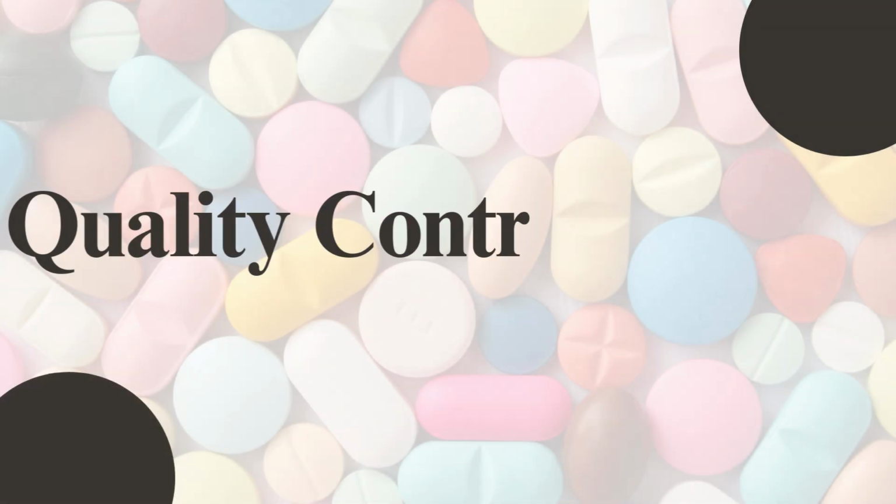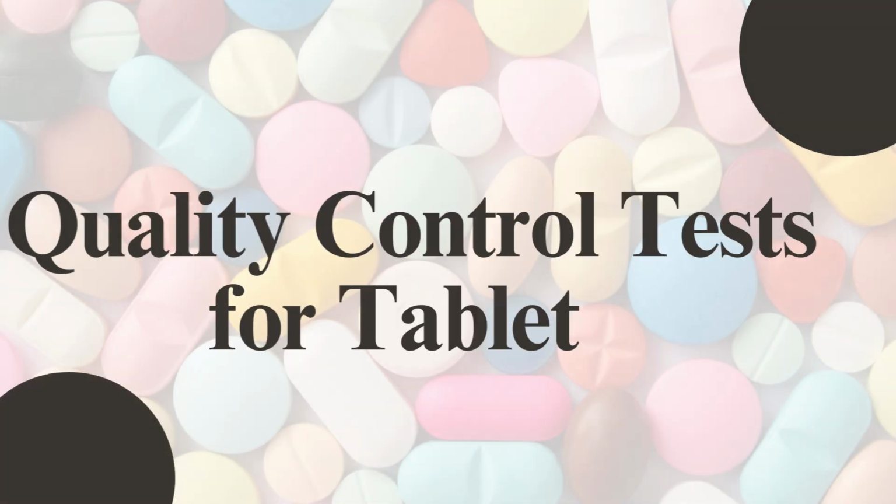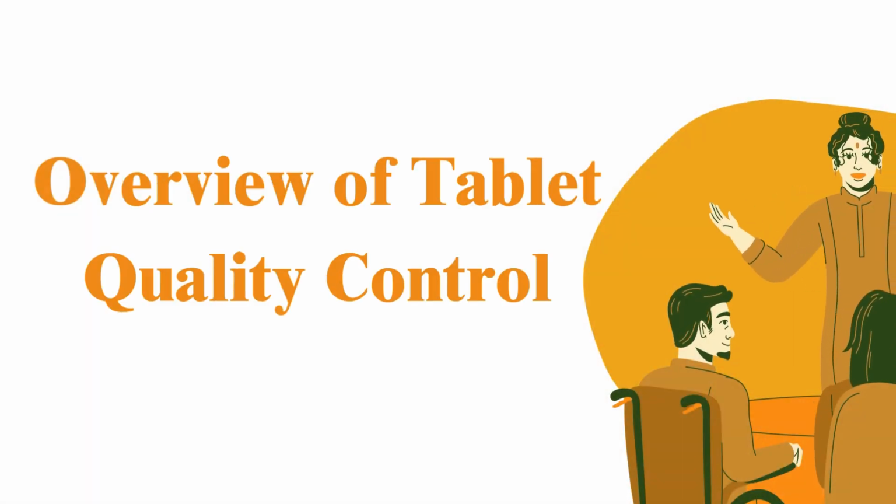In today's video, we're exploring a crucial topic, quality control tests for tablets. These tests ensure that the medicines we take are safe, effective, and meet the highest standards of quality. Let's jump right in. Overview of tablet quality control.